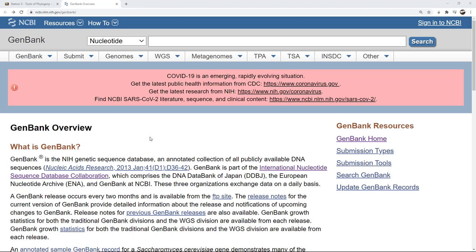The link that I've given you in the lab will take you here to this particular page. There's a lot going on in GenBank — a lot of research associated with it and other things. We're going to use it for a specific type of information: we're going to be looking for a protein sequence that we can compare between different organisms for a phylogenetic analysis.